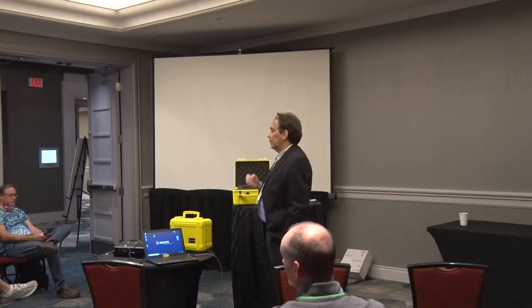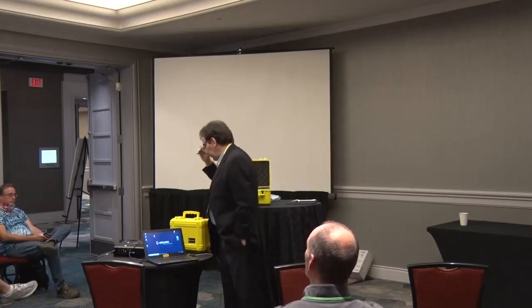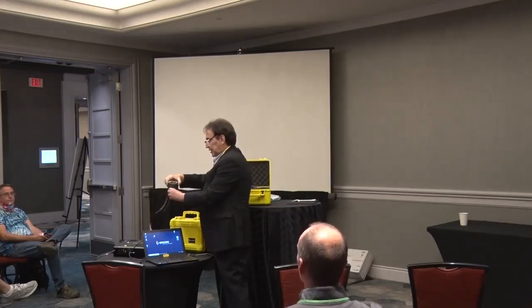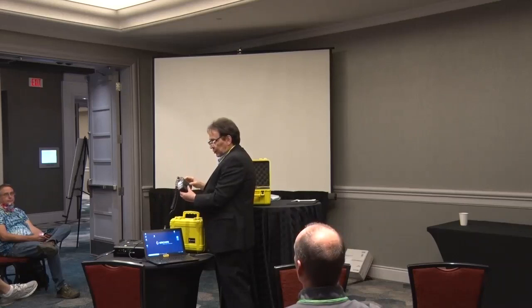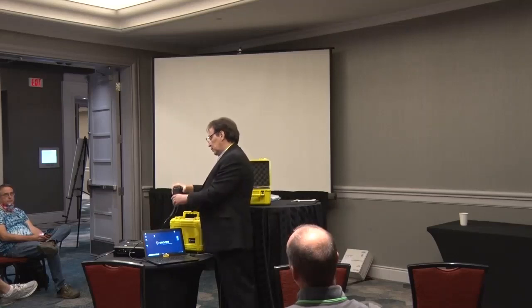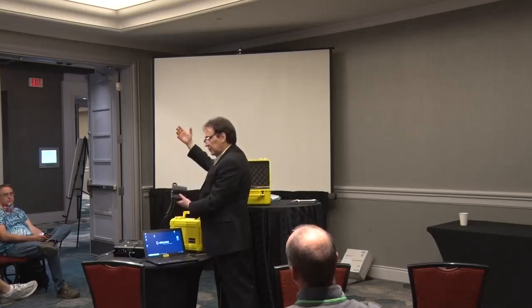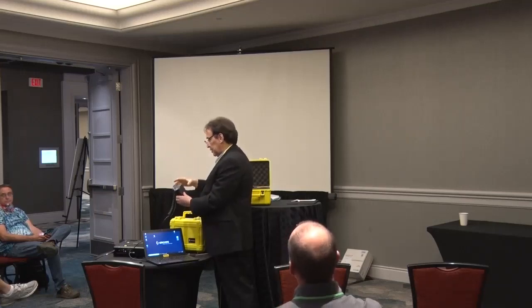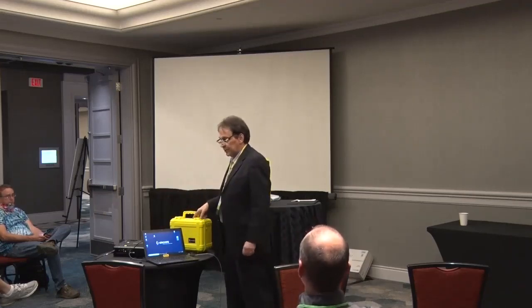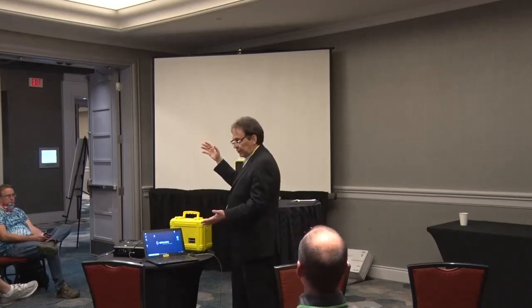Yeah, because it's so sensitive, it's still picking up the stuff that's stuck to the outside here. But it's got math inside the unit that subtracts that, so that gives us our fast recovery. It was 100 just now, and now it's at 35 in the reading, and we had 1,200 before, so we had a good fast recovery. I could go and measure this again, and again see the 1,200.